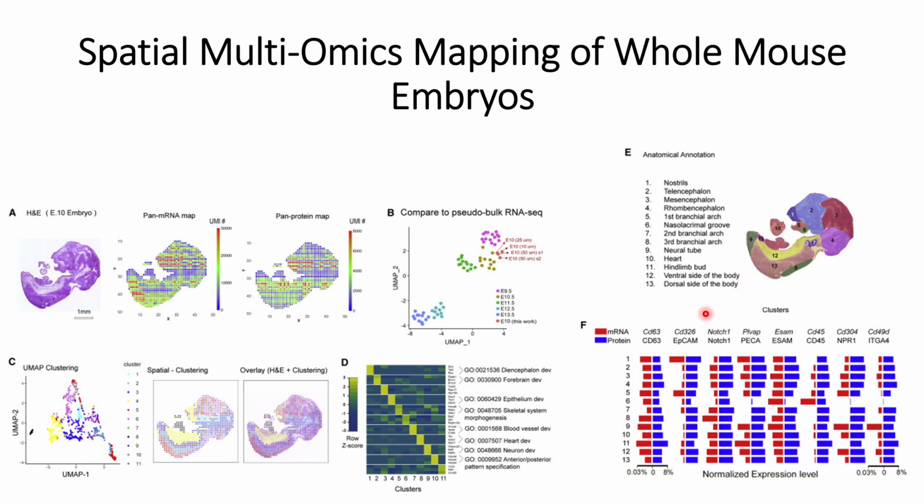And after that they compare some of the mRNA and protein expressions in the different clusters, and they can see that most of the mRNA and protein expression results are comparable in the different clusters, as can be seen here. If the mRNA expressions are high, then the protein expressions are also high. So this also validates the DBiT results.